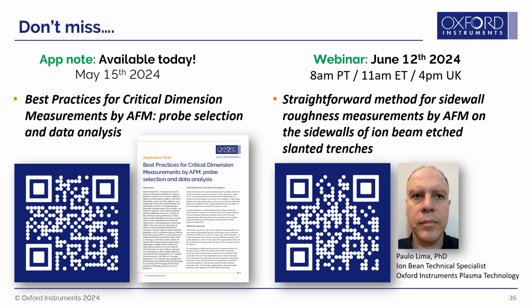Okay, great. So there's a few questions about the cantilevers themselves. Do you have to image at 90 degrees? In one of the presentations, I think it was your section, Ben, you talked about the asymmetry of the tip. How important is it to image at 90 degrees?